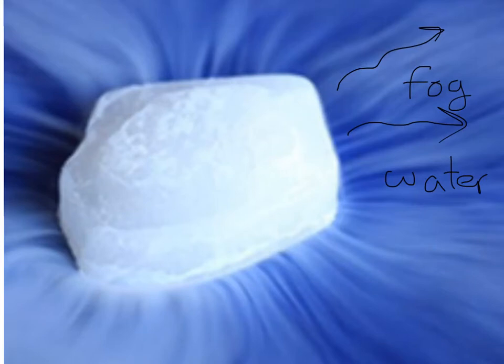So what you're seeing is that everywhere we take the dry ice, the air right around the ice gets cooled off and turns whatever water happens to be in it into a fog or a cloud of liquid. So you're not seeing carbon dioxide gas coming off it. You're seeing water form around your dry ice.